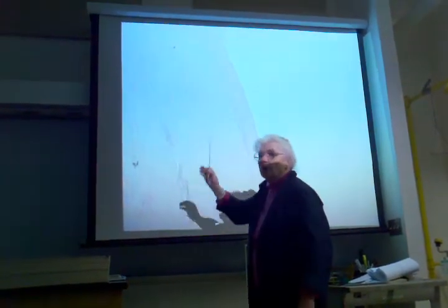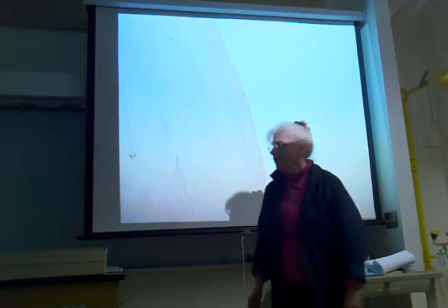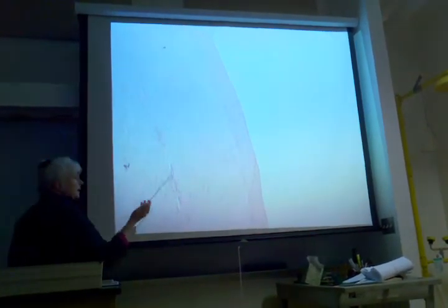Okay? This is a cross section. So, if it's a cross section, the circular muscles are going to look different than the longitudinal muscles, right? And you see a difference here between these on the outside, and if you look at it at a higher power, I'll do that.